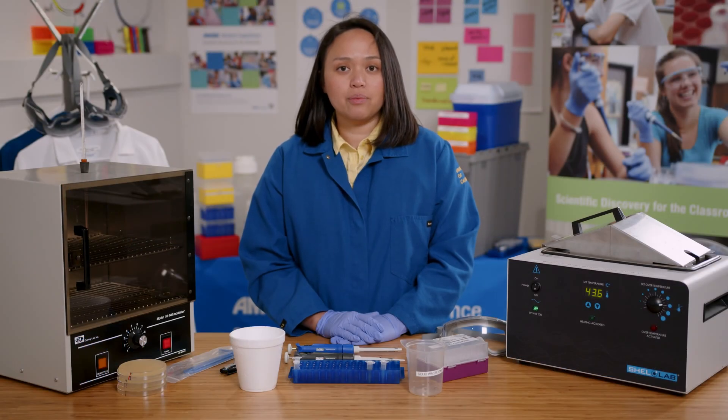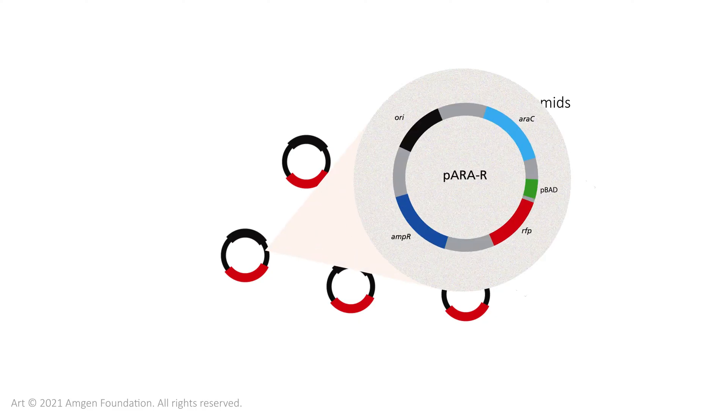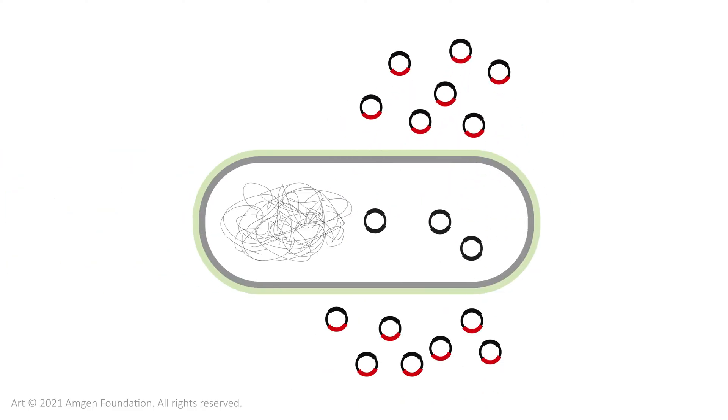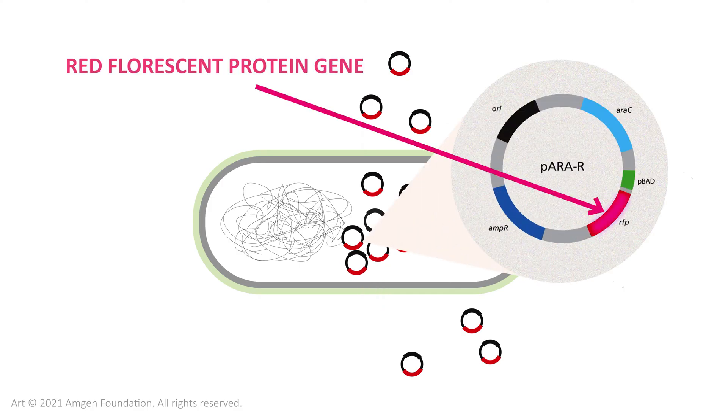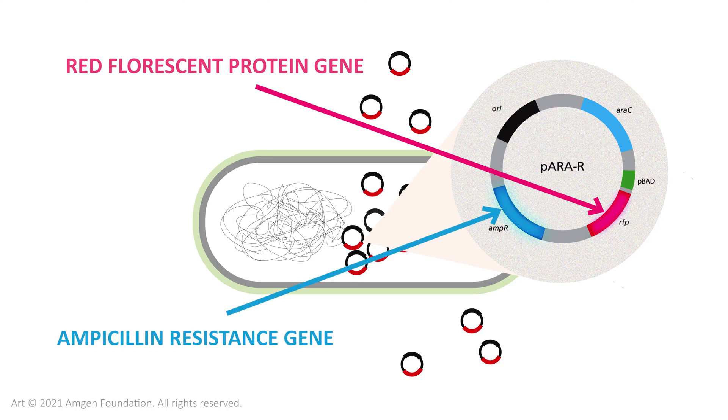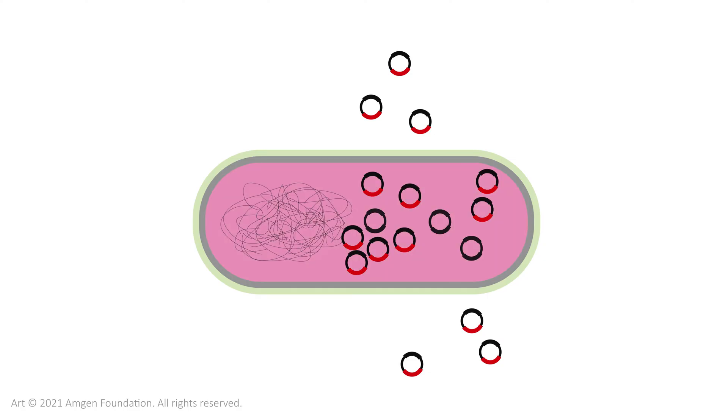I'm going to demonstrate lab 5 where I will use the plasmid from the ligation in lab 3 to transform E. coli bacteria. The plasmid has the RFP gene, the red fluorescent protein gene, and the ampicillin resistance gene. It can grow on a plate with ampicillin where it will express the red fluorescent protein.